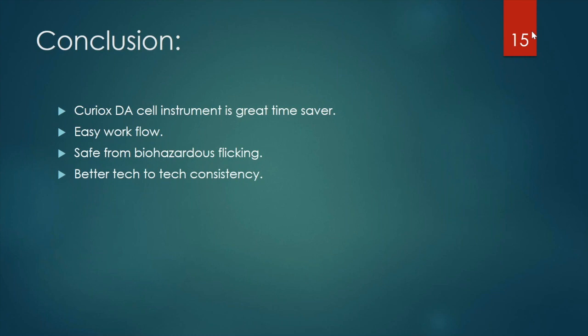Thank you. How fast and easy was it to optimize the assay? Specifically, how many days of work did it take to achieve the right assay conditions? This would vary, definitely. It will vary from lab to lab depending upon your protocol.